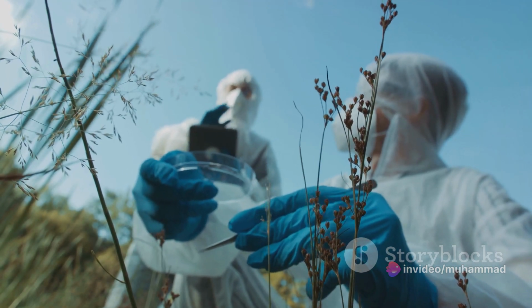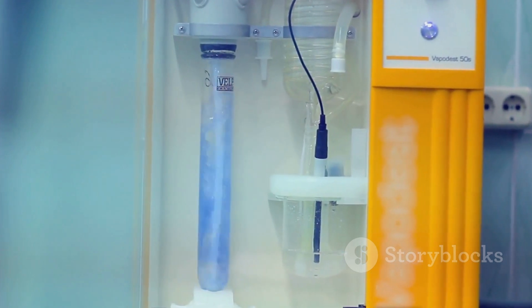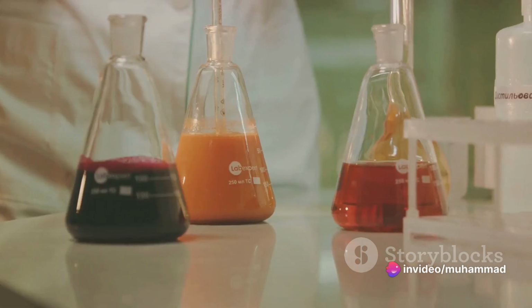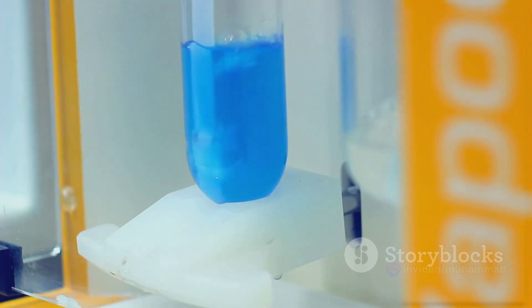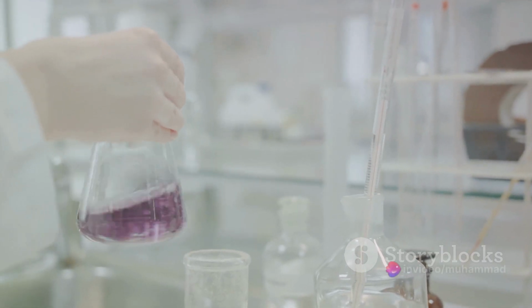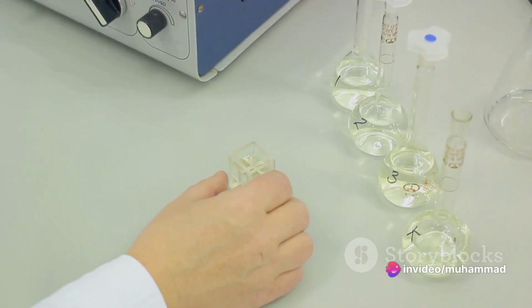Now, you might be wondering, what's the difference between liquid and gas chromatography? Well, the key difference lies in the state of the mobile phase. Liquid chromatography uses a liquid mobile phase, while gas chromatography uses a gas. This simple difference significantly affects the types of samples they can analyze. For instance, gas chromatography is not suitable for large or thermally unstable compounds, which liquid chromatography handles very well.